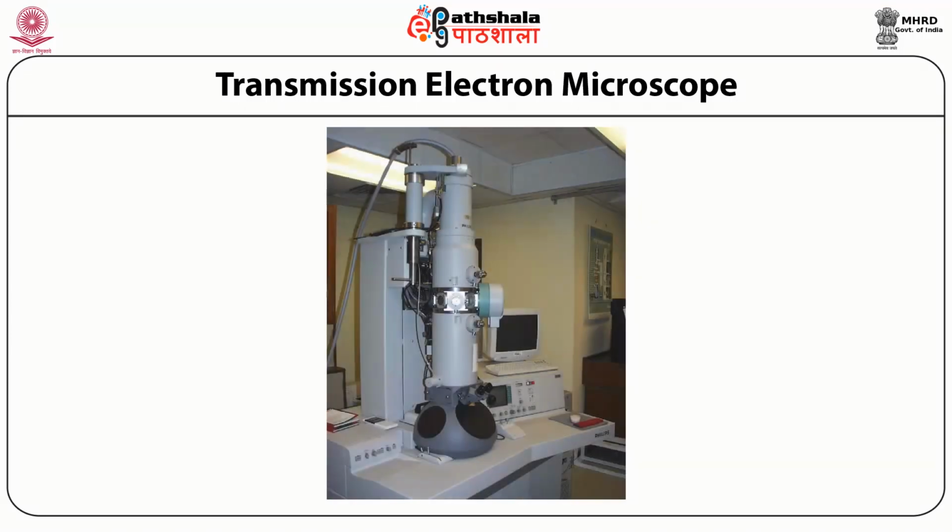The image here shows a working transmission electron microscope setup present in a lab.